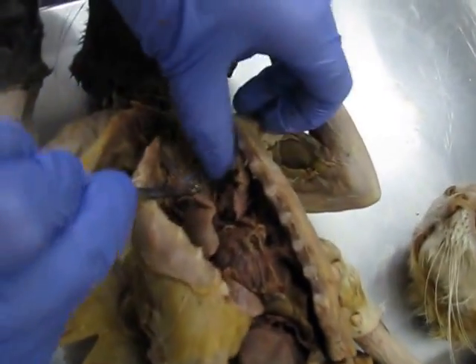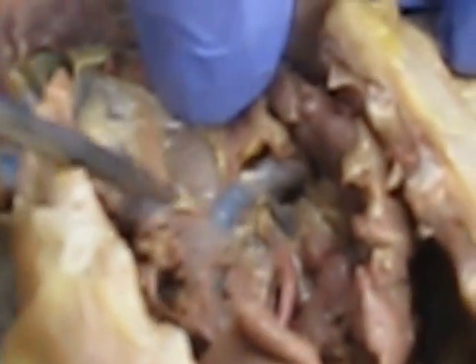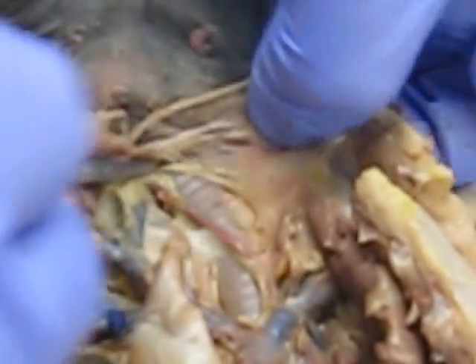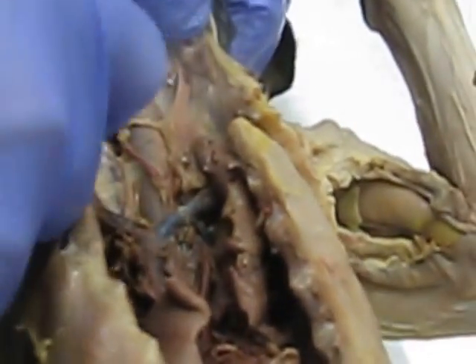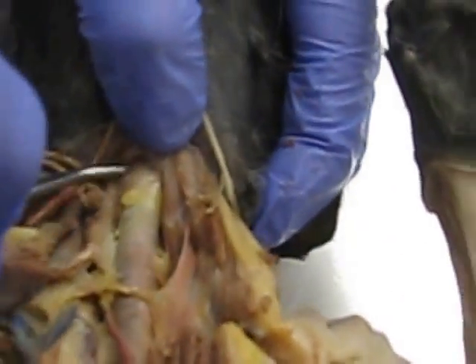We can also see the trachea. If we move these vessels aside, you'll be able to see the tracheal rings. And then if we move up further, there we go. You can also see the larynx. Specifically, you'll be able to see and feel that thyroid cartilage. So the larynx is going to be located right here.